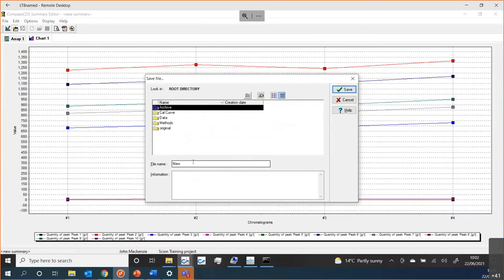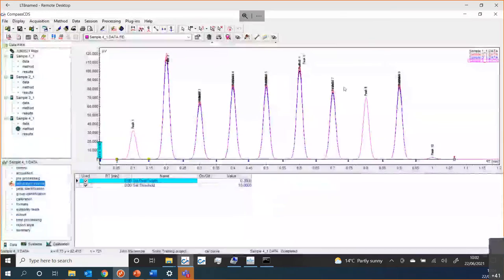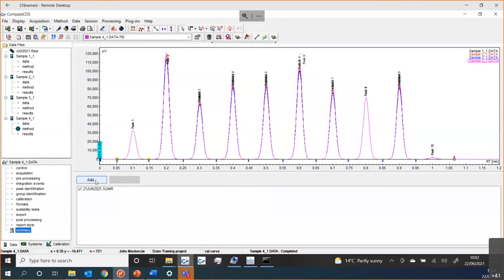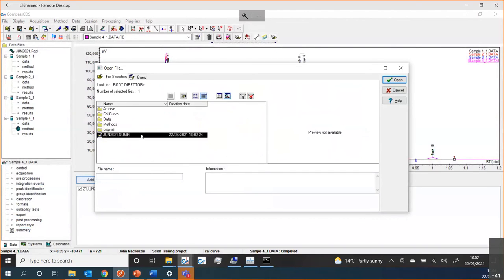I'll say yes to save that summary report and give it today's date. If I wanted to add each data file I create to my summary report, that is very straightforward to do in the method file — you can choose Add and select the summary report you're going to use. When that's saved back to the method, every time you run the method the results will be added to the summary report. You simply open the summary report and it will show you the current data for that batch of samples.